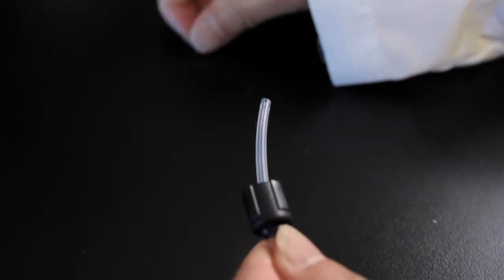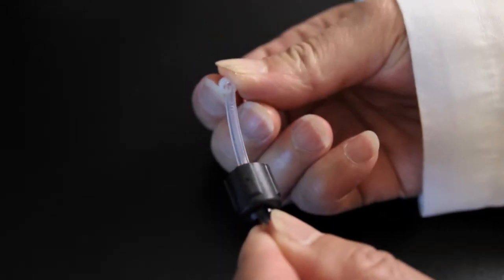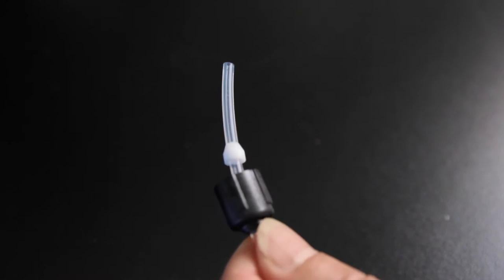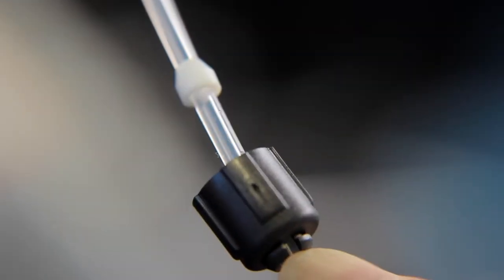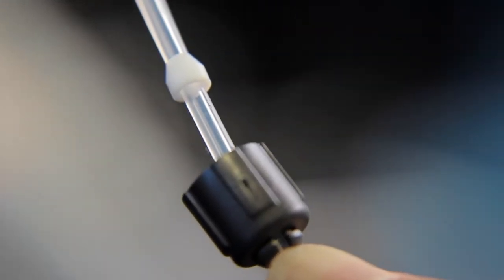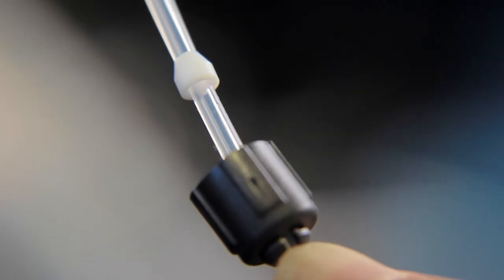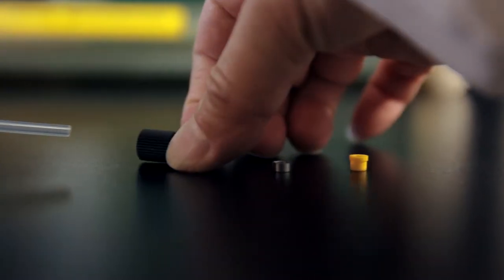To make the collet nut connection, slide the nut fitting and ferrule over the tubing, making sure the tapered end of the ferrule faces the end of the tubing and the blunt end of the ferrule faces the nut.